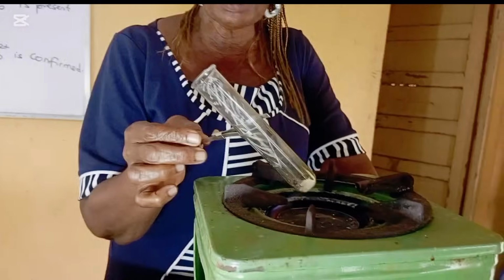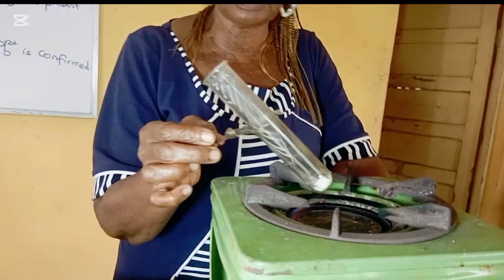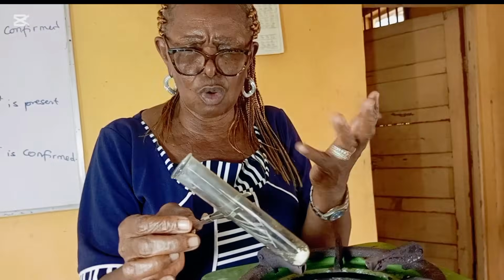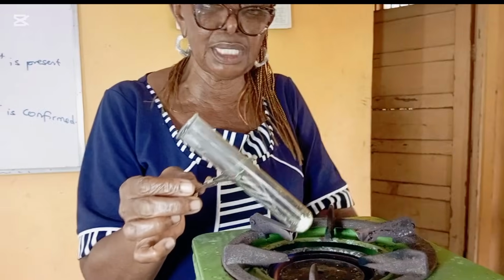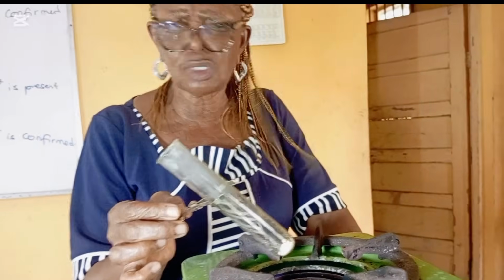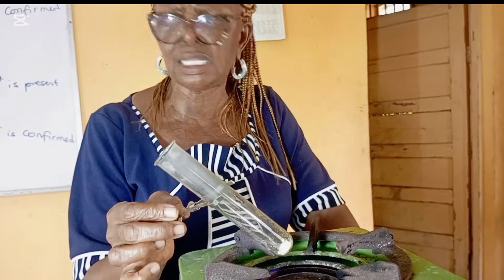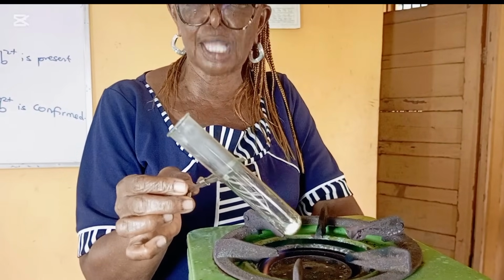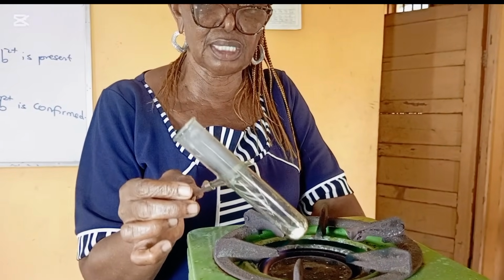And there's something I also omitted. When I added water to sample C, I felt a cold sensation in the test tube, meaning that the dissolution of sample C is endothermic. It was endothermic because heat was absorbed from the surroundings.